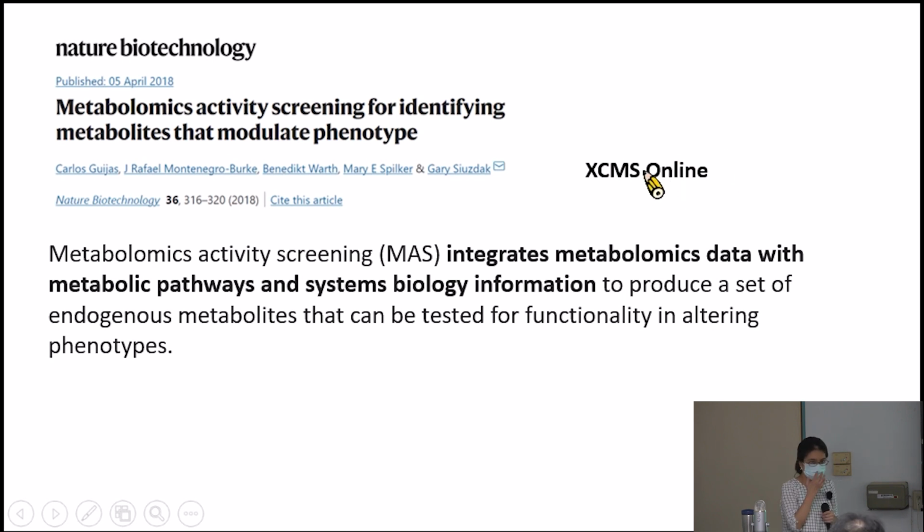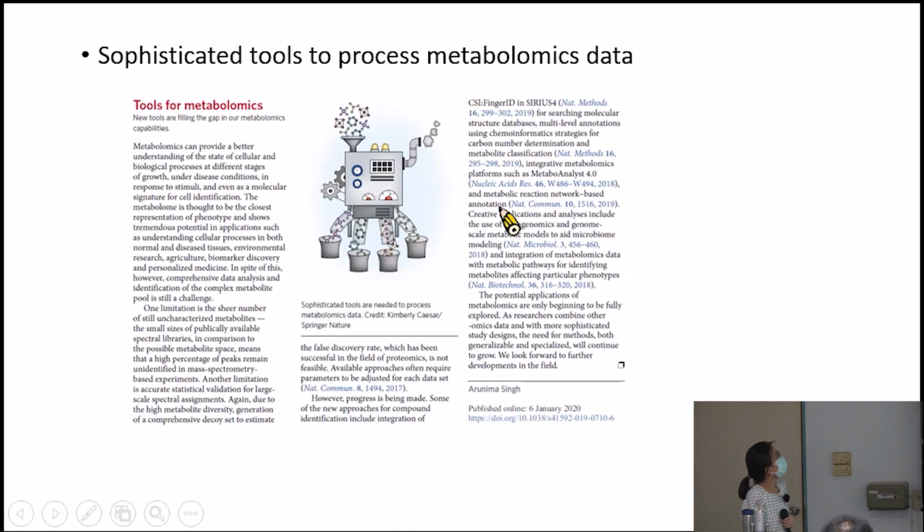And this platform is very similar to what we talked about with MetaboAnalyst. So in our first section, we talked about the different approaches. Through this introduction and the different tool introductions, we know that the conventional approach in metabolomics analysis is for mass spectrum data analysis.